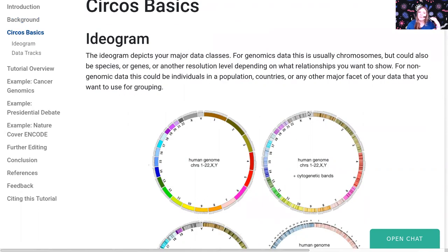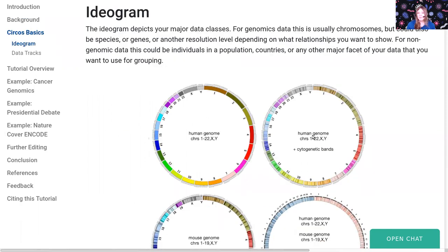So let's talk about some Circos basics quickly. This is the ideogram — the thing that appears around the outside edges and to which all of your data is plotted relative to. This could be chromosomes, it doesn't have to be. In most of the examples we'll cover though, we define the ideogram to be the karyotype of a genome, which are all of the different chromosomes and their lengths.